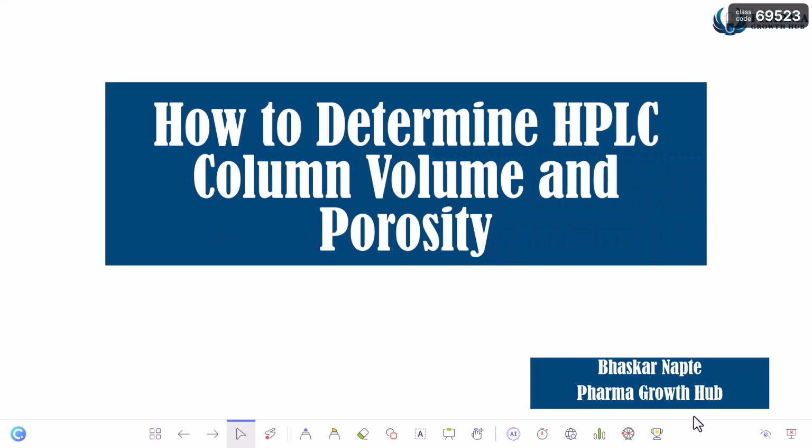So today's topic of discussion is about an HPLC column. That is going to be about how to determine the HPLC column's volume and how to understand the porosity of an HPLC column.